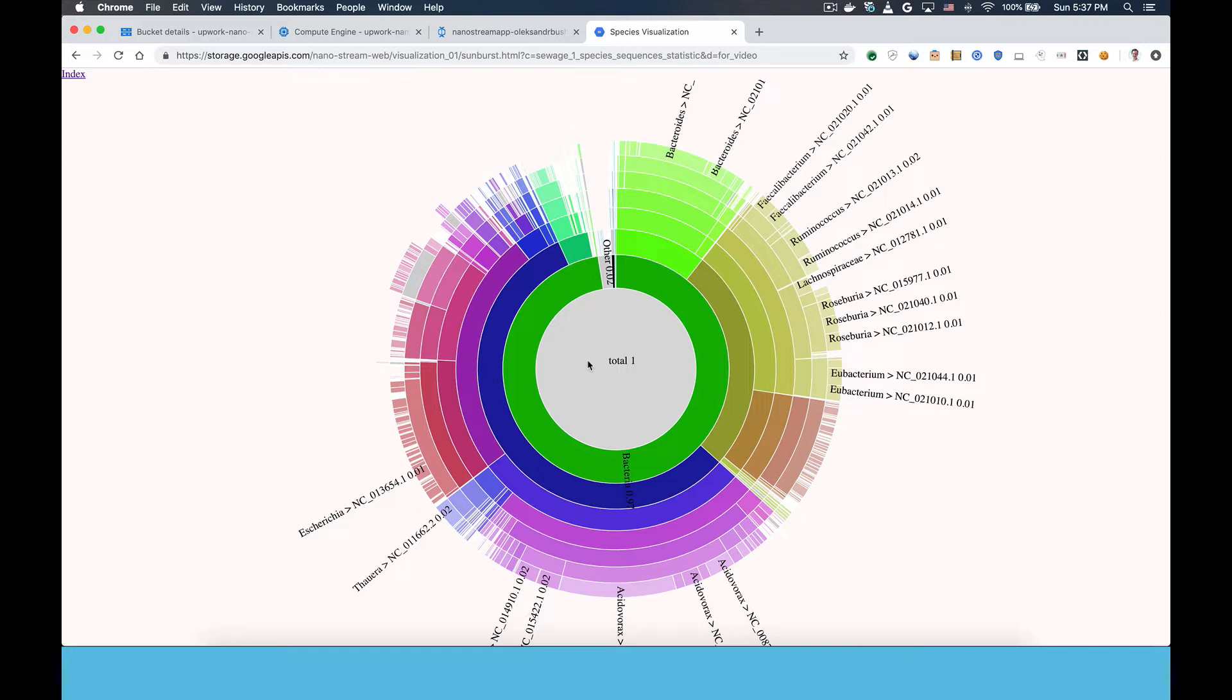For example, you can see that bacteria accounted for 97% of the DNA in the sample and that E. coli was 9% of that.